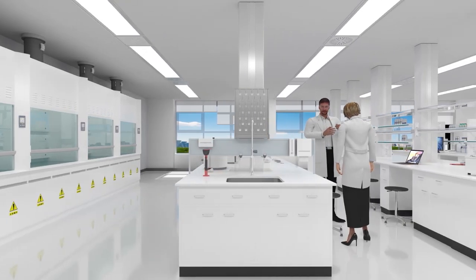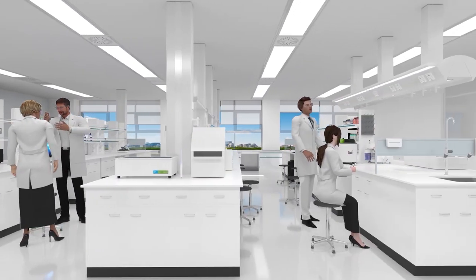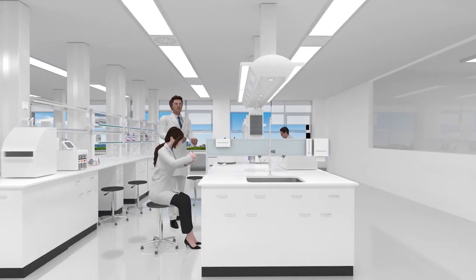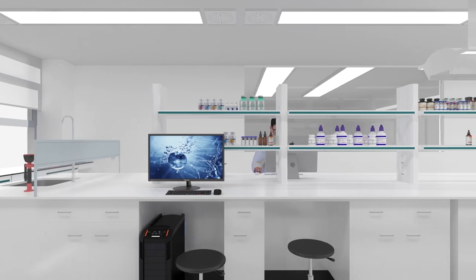Today's laboratories performing trace elemental analysis are under pressure to deliver accurate, repeatable results with maximum uptime. ICP-MS is the technique of choice to meet these demands.